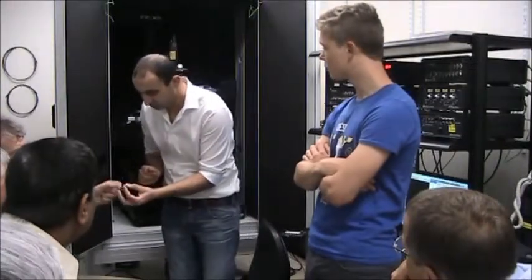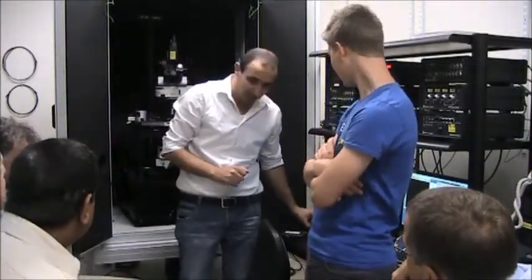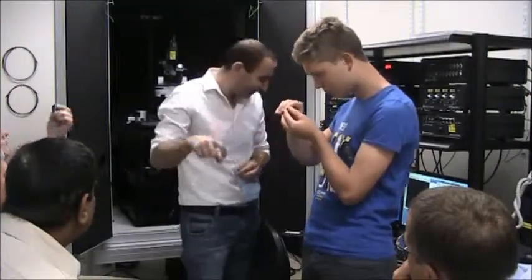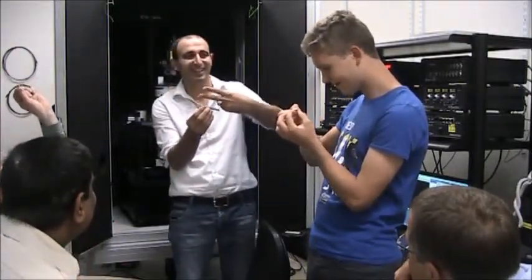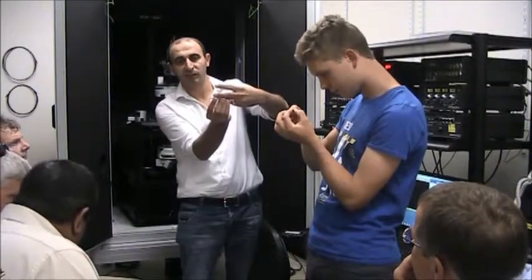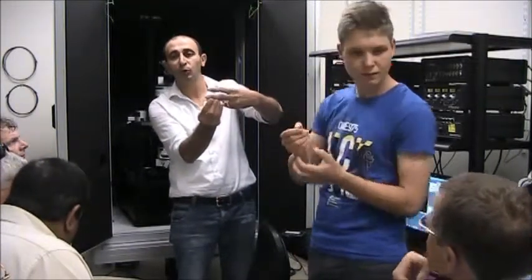So you can just move it, and if you look to this side, you will be able to see the cantilever, and if your eyes are strong enough, you can see even the bend of the tip. So it looks like this, in fact. This is the cantilever and then the bent area. So the tuning fork in this case will be working in normal force.